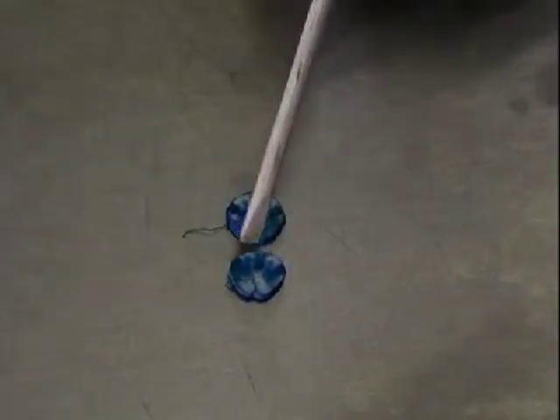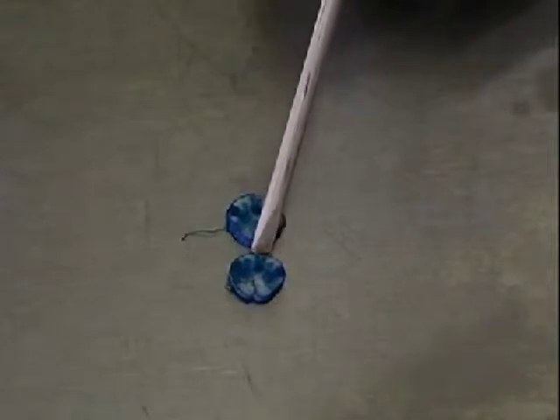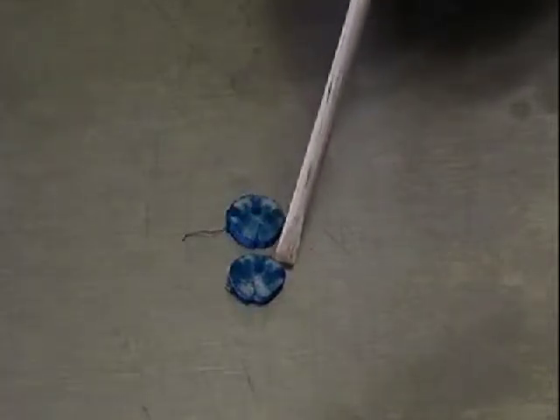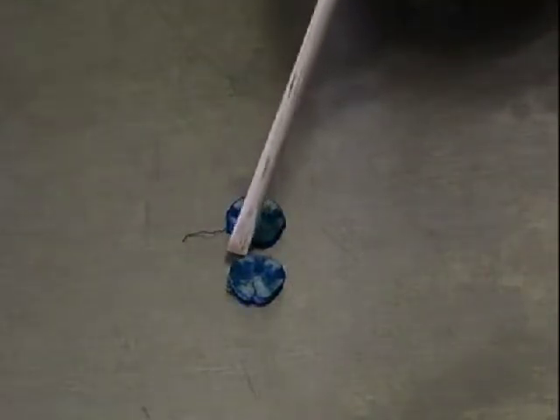You come up to the top here, you see these two blue areas would be nucleus gracilis and nucleus gracilis on the right and left. And then if we move a little lateral, you can see a big fasciculus cuneatus, nice and white, nucleus cuneatus lying underneath it. On the other side, the white fasciculus cuneatus and nucleus cuneatus underneath it.